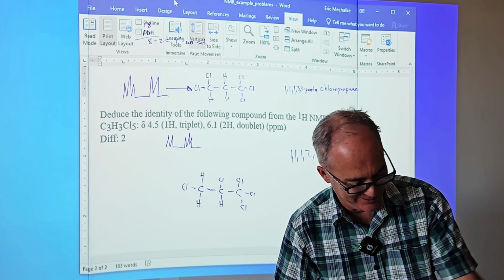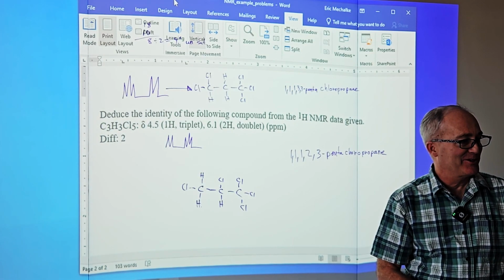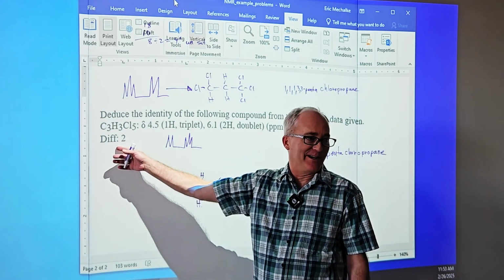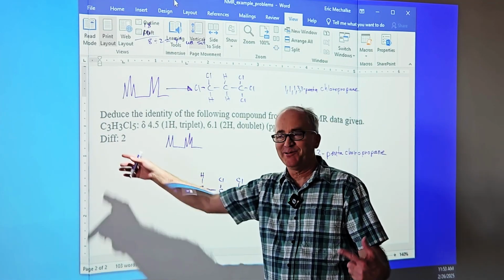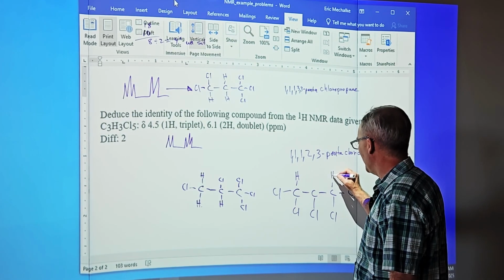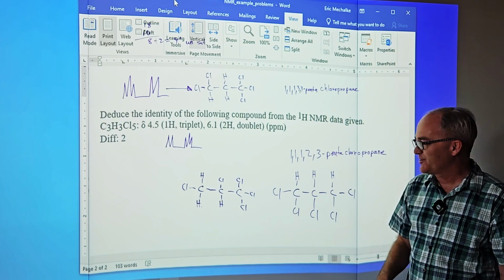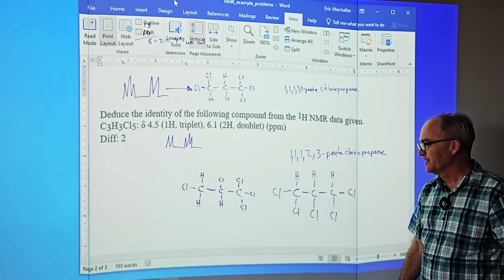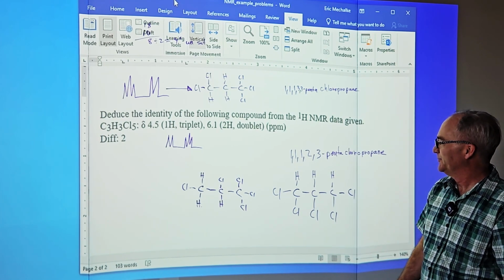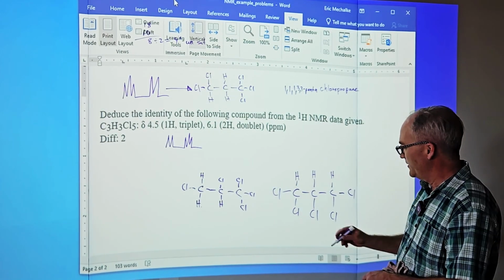I think I have the answer. And I stand corrected. There is a third option. Maybe this should have been a 3. I'm up here thinking, man, this 2 is so simple. Symmetry. Symmetry in old age. I looked at this when I was putting it together. I should have remembered, huh? This is the correct answer here.